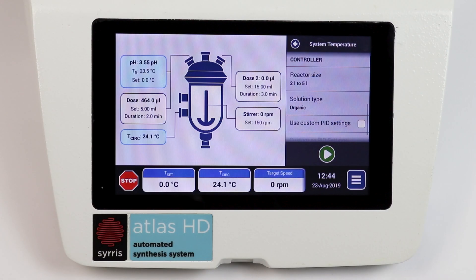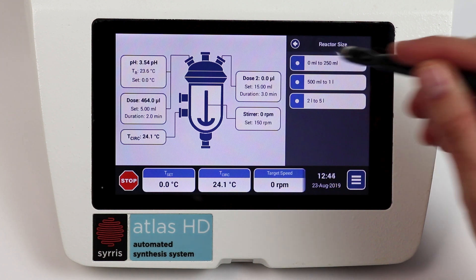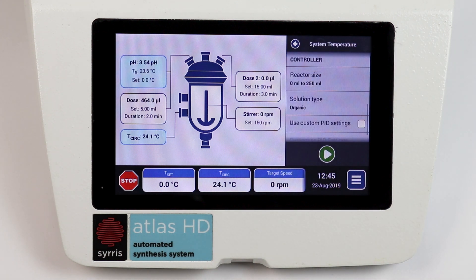Atlas HD has improved temperature control through the use of pre-configured PID settings. Simply tell the system the vessel size and the solvent type and the Atlas HD will select optimized settings to get your reaction to temperature as quickly as possible and as accurately as possible.